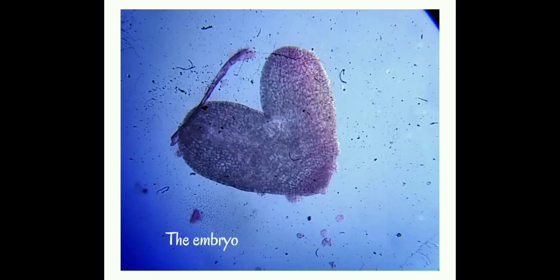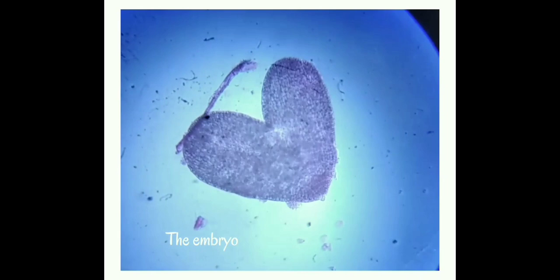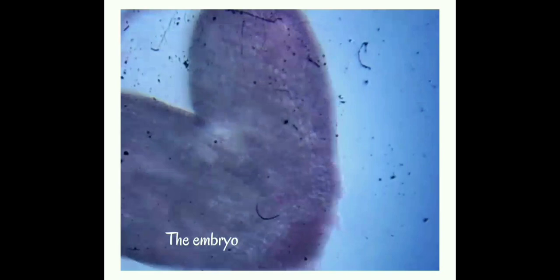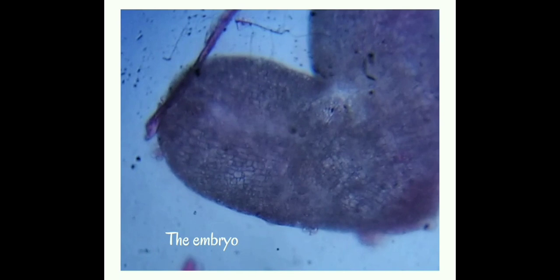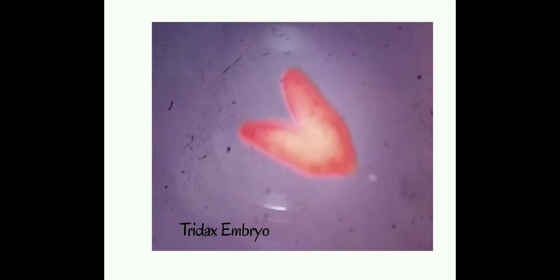This is the embryo, which is a heart-shaped structure. Mount these embryos with glycerin and with the help of a cover slip, and observe under the microscope. This is the mature embryo.